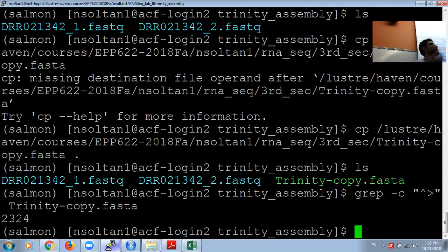And then at the end, it says 70% or 80% of your genes have an ORF, open reading frames, that are similar or have similar functionality with the ortholog database, in this case, Proteobacteria. So you can define that my assembly has a good number of ORFs found based on a Proteobacteria ortholog database.